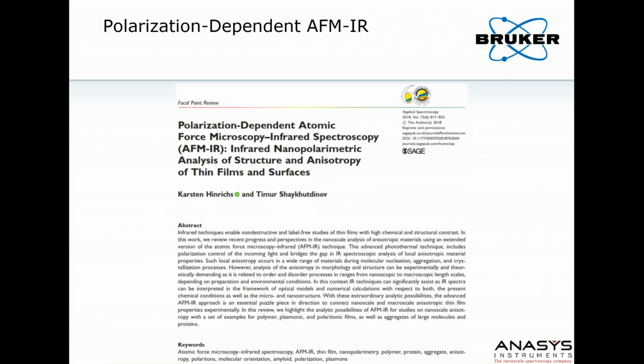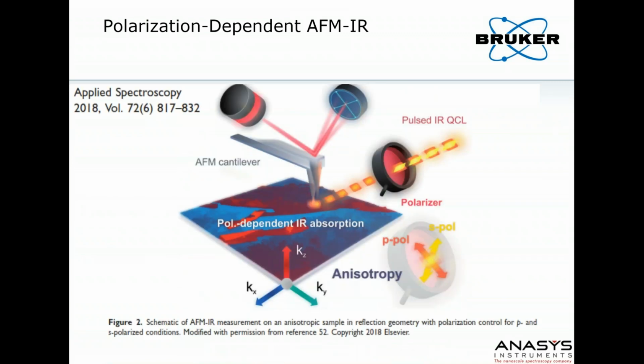Just last month in Applied Spectroscopy, a focal point review article was published by Karsten Hinrichs' group. He was the first Nano IR customer in Germany, and he's really been doing some extremely nice work taking advantage of the polarization. This is an area that's dear to my heart. I've always worked with polarized IR, and I think it's an area that has a lot of opportunity for AFM-IR if you take advantage of the fact that the light is polarized. And so this paper has a whole bunch of examples.